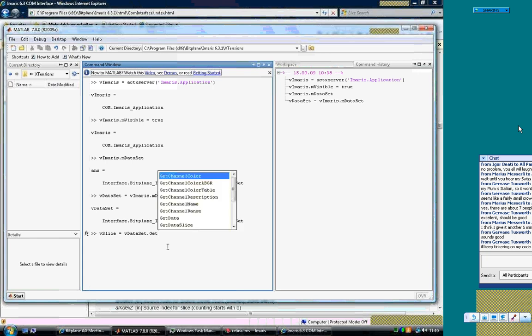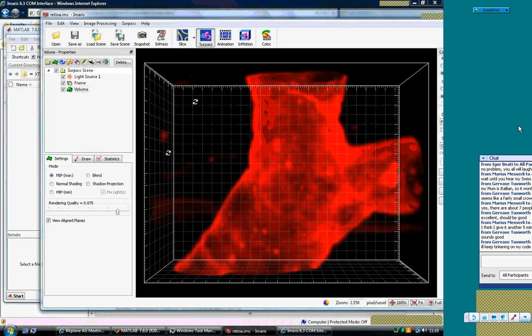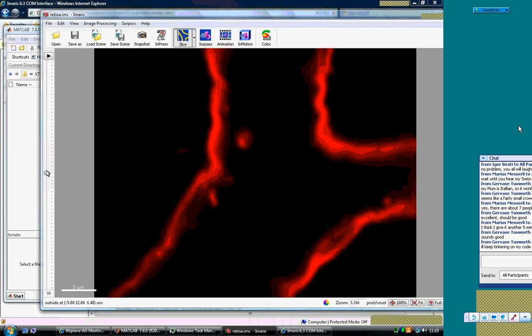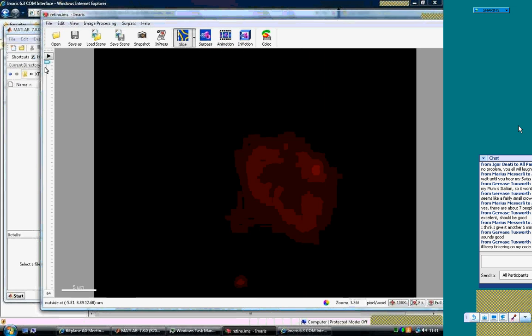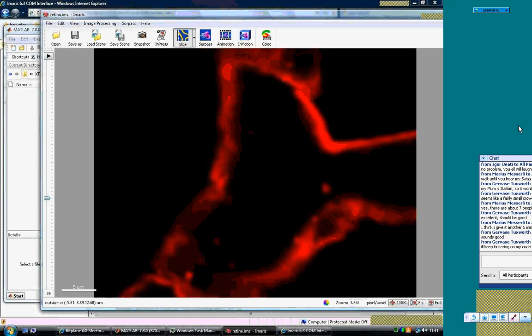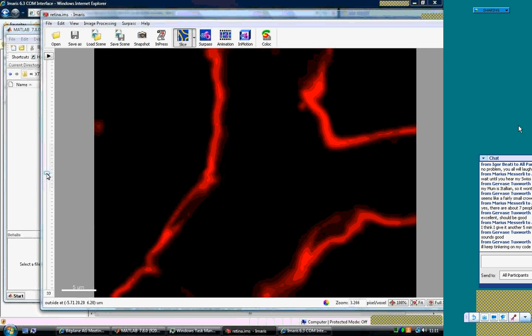Now we specify the index in the Z dimension, and we have 64 slices, so we have an even number of slices, so we have 2 middle slices, the 32 and the 33.